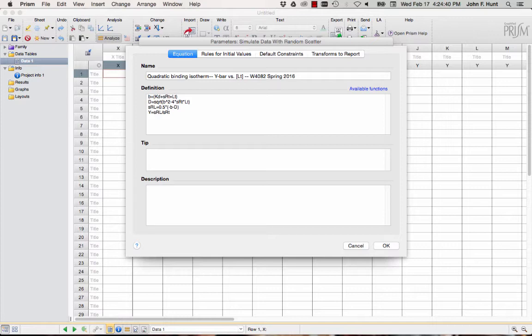On the other hand, when you're not deeply familiar with something and you're not a master of PRISM foo, it is much easier to do it the way that I just showed you here. So I first said b is a variable because it's not one of the standard PRISM variables, which are basically x and y. It will assign this to be a new variable, and so it will interpret this as saying some new variable b equals a variable or parameter KD plus a variable or parameter SRT plus a variable or parameter LT. So that defines a variable b.